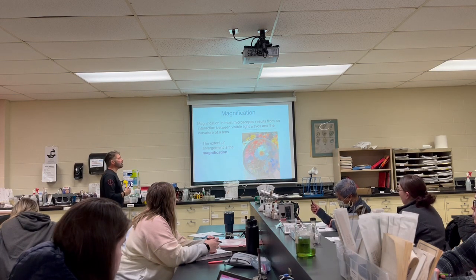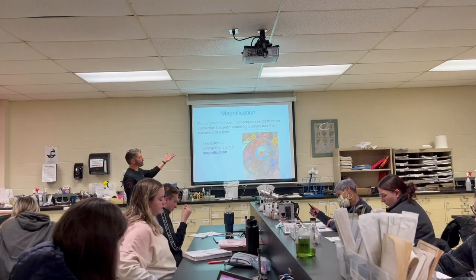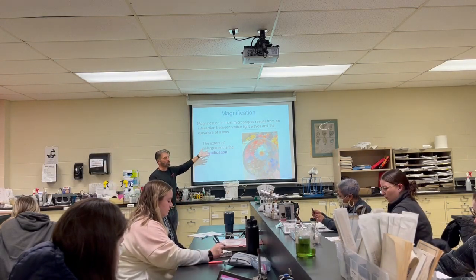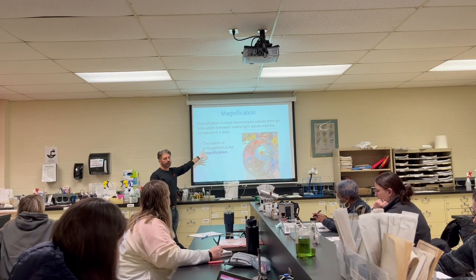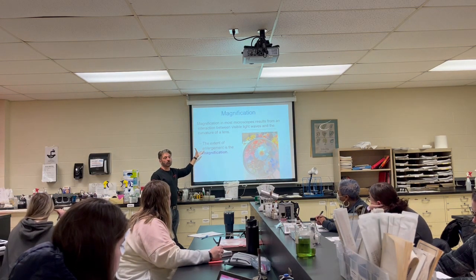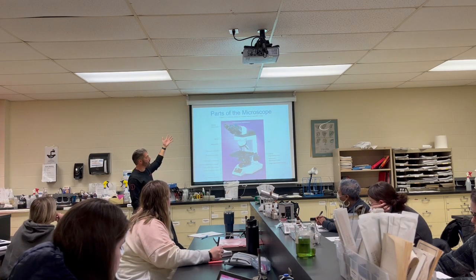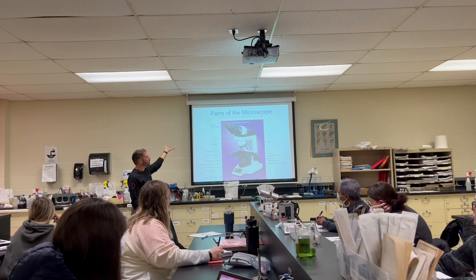So the extent of enlargement is the magnification, and for anything eukaryotic or plants, we really don't need to go into that much detail. They're going to talk here in a minute about wavelength. That has the biggest thing to do with magnification. So there's just a basic microscope.